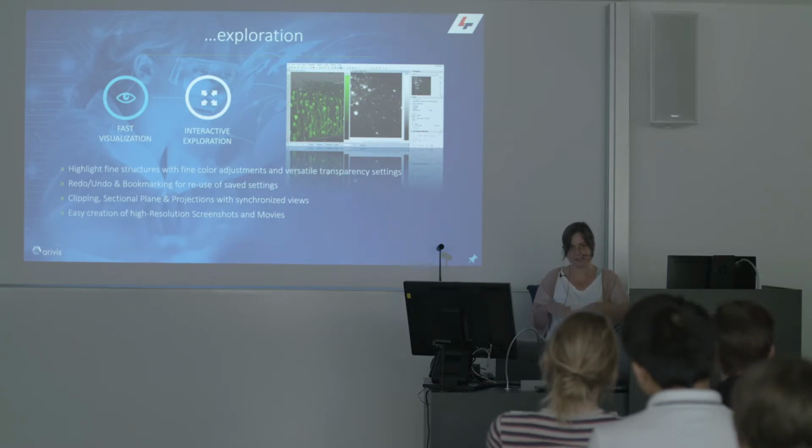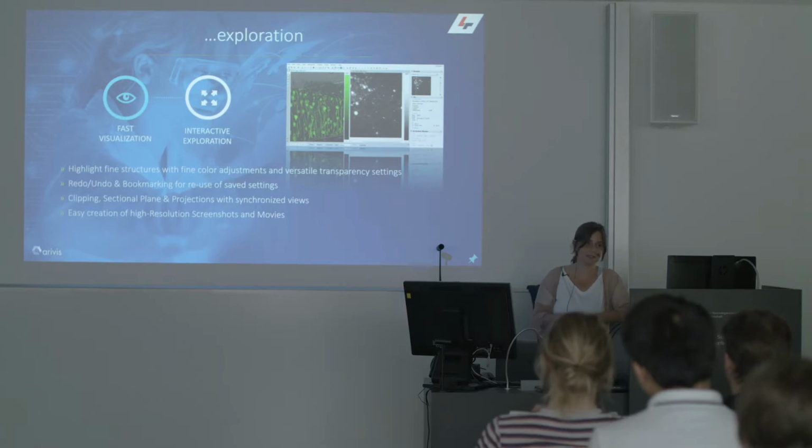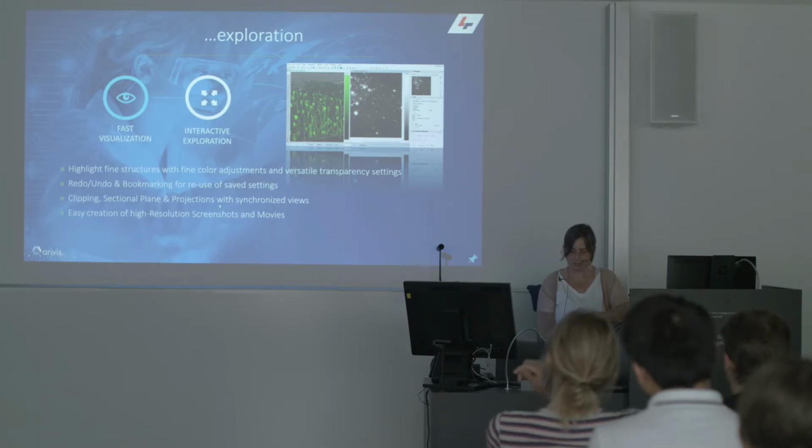But the principles should be fine, or I would like you to be reassured that you can use Vision 4D in this case really to handle whatever comes in the future. So basically there's functions like undoing and bookmarking, and I think this is all topics for the hands-on sessions during the workshop.